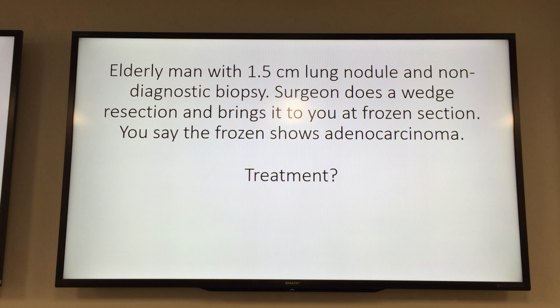Now some people will argue that the parenchymal margin is not significant. And in fact, in our old institution we never sampled the parenchymal margin. But here, how we do it is we say that margin is significant too. So we want to know, is that margin involved? Does the tumor get to there? So this edge is not a margin anymore. What is a margin is this. So you want to cut like that and ink one side of it so you know what happened at that edge. So there is really a parenchymal margin.